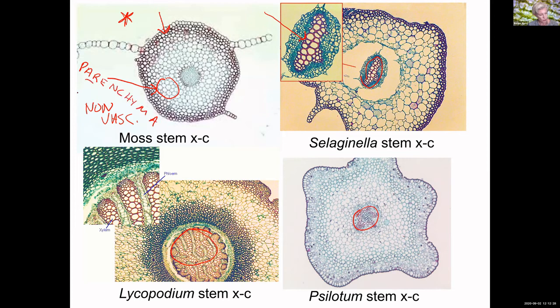If I was going to draw one of these cells, it would be moderate size, with a thin cell wall. The cells around the outside are for structural support and are called collenchyma. If we drew a close-up of those cells, they would typically have a somewhat smaller inside and a thick cell wall.